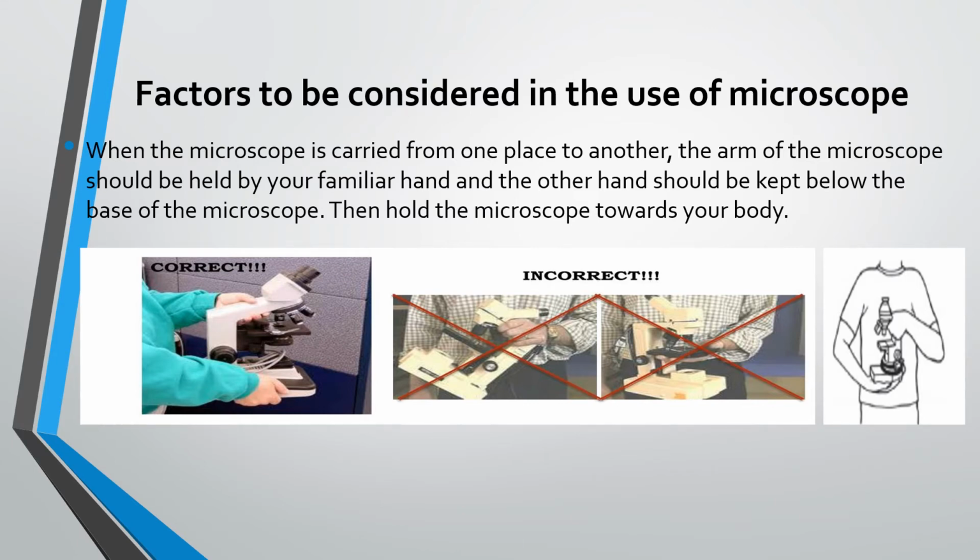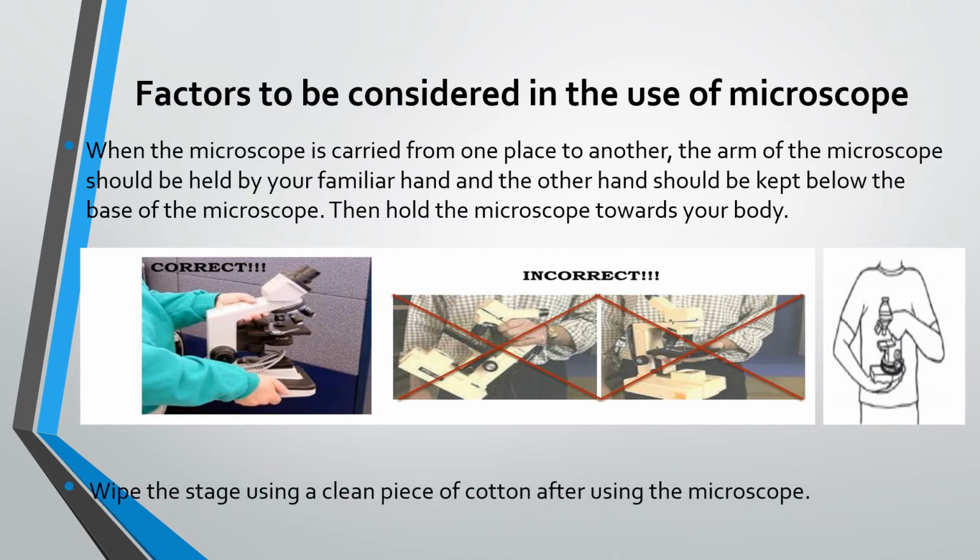So this is the correct way of carrying the microscope. And also you should wipe the stage of the microscope using a clean piece of cotton or tissue paper after using it.